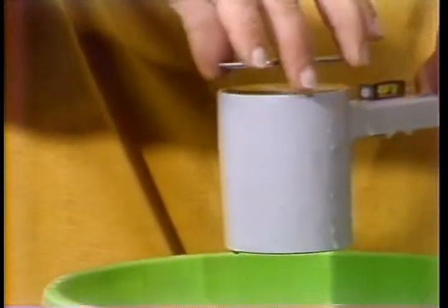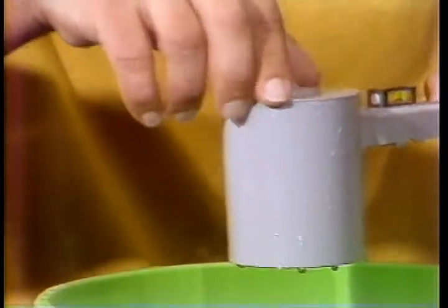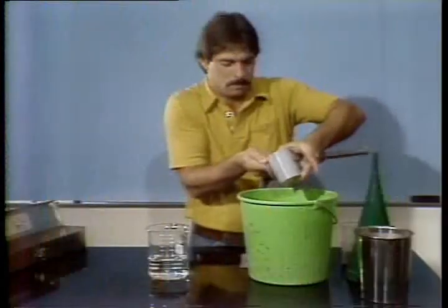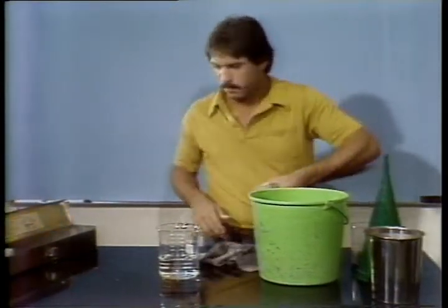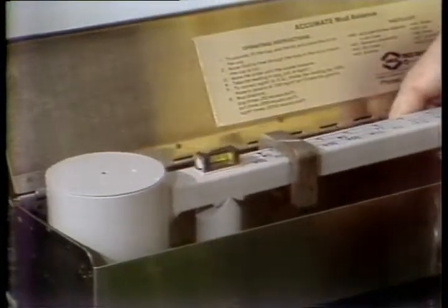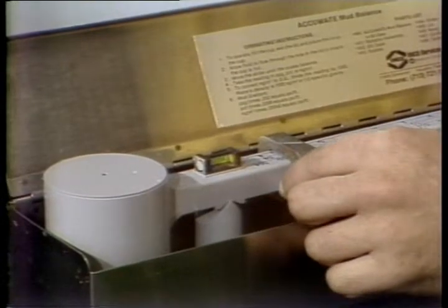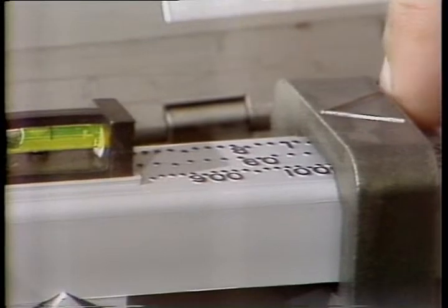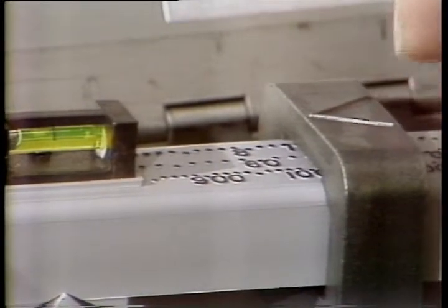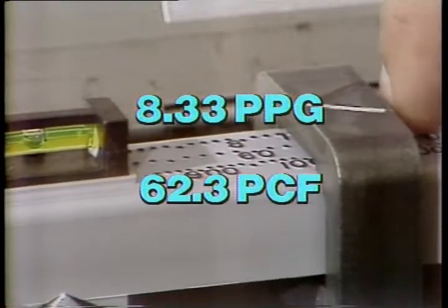Place the lid on top and dry it off. Be sure to put a finger over this hole. Then place the balance arm over the fulcrum. Slide the counterbalance until you get the bubble centered in the level gauge. Your scale should read 8.33 pounds per gallon or 62.3 pounds per cubic foot.